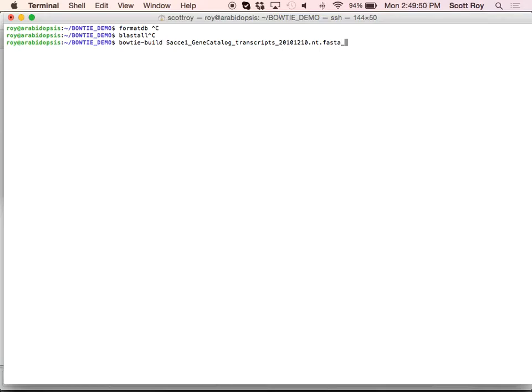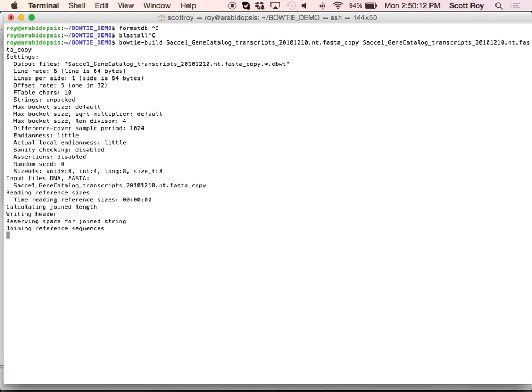So in this case, I'm going to do it with copy because I previously ran this because it takes a little bit of time and I didn't think you wanted to watch it. So we're going to just type in the name of our file twice. So copy is just the exact same file we just saw. It's just a second copy of it. And so when I hit return, it's just going to start running.